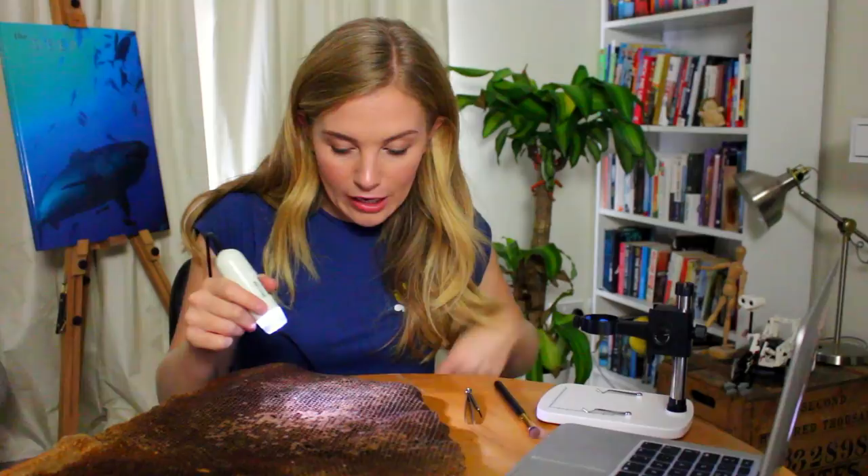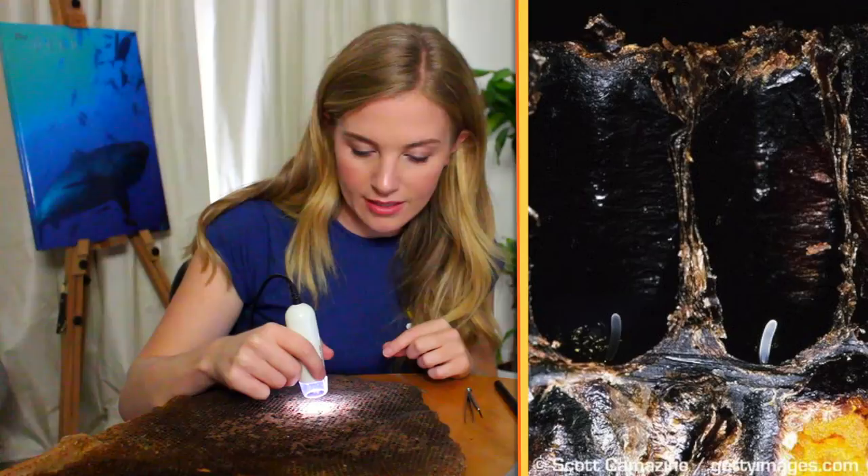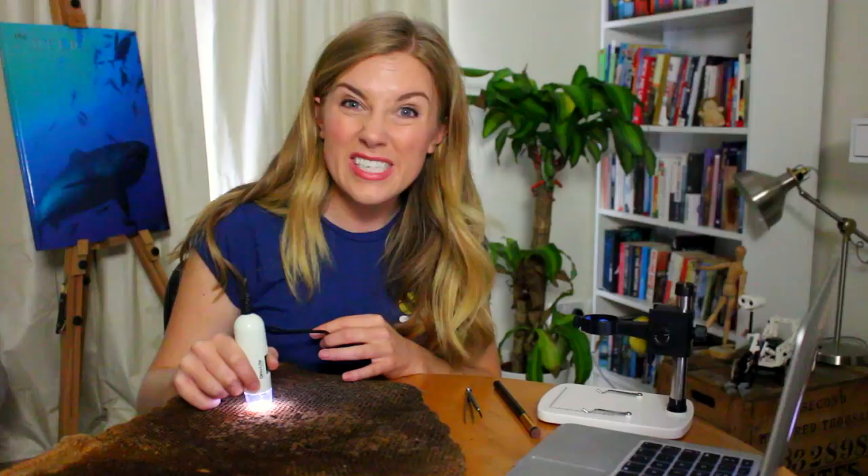The first stage is the egg. I'm looking for something that looks like a grain of rice — it's only about 1.7 millimeters long — and the queen lays it so it's almost standing upright inside the cell. It would be really lucky to actually find an egg in here, simply because the bees have long since gone and any eggs left behind would be a tasty treat for any little critters that might have explored this wax comb.